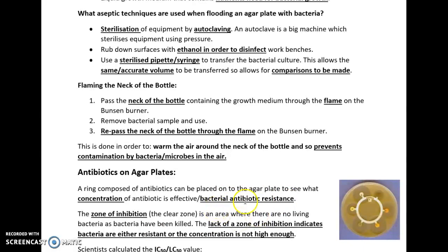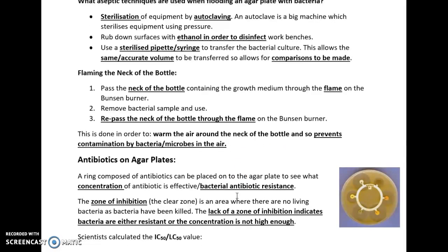We can also look at antibiotic resistance. With different antibiotics — for example doxycycline and amoxicillin — some bacteria might be resistant to amoxicillin, hence there is no clear zone, showing which antibiotics work against bacteria. They might ask you to explain antibiotic resistance, which is a type of directional selection. Random mutations lead to the production of antibiotic-resistant alleles. The bacteria survive and reproduce — this is natural selection — and pass on the allele for resistance to offspring, increasing the allele frequency.